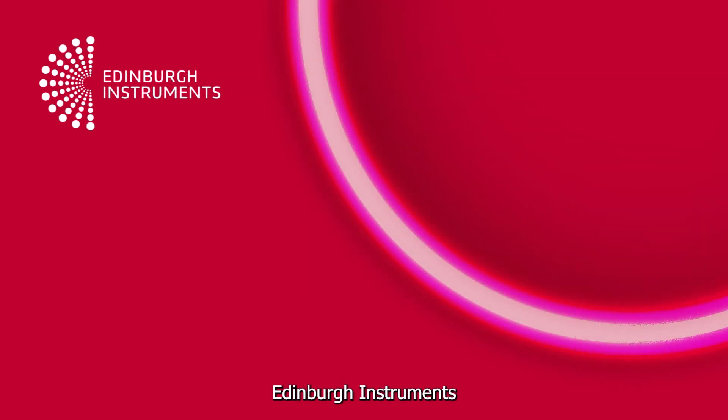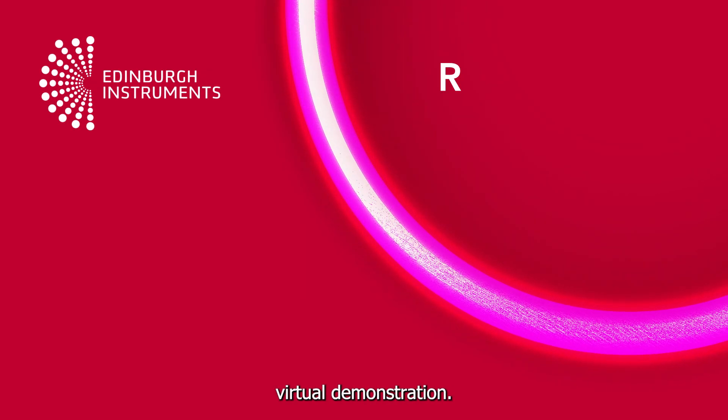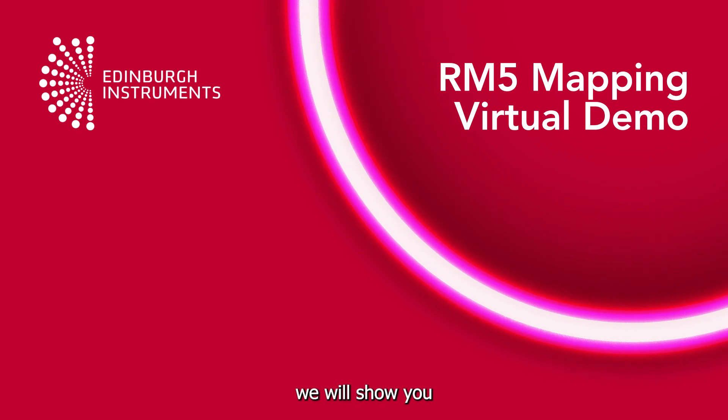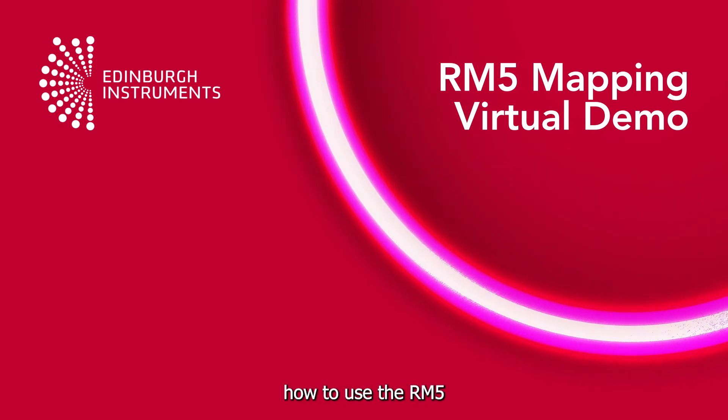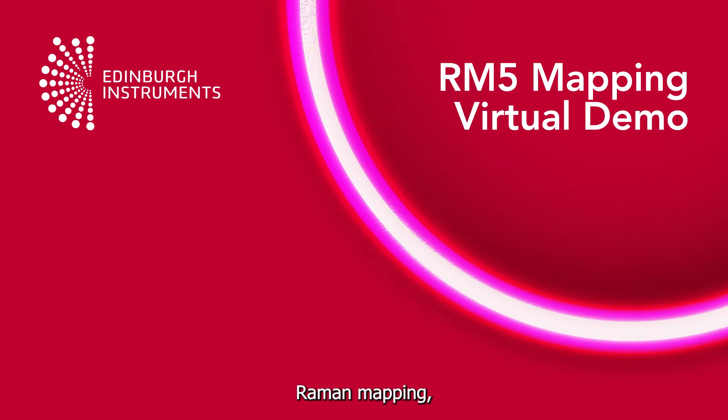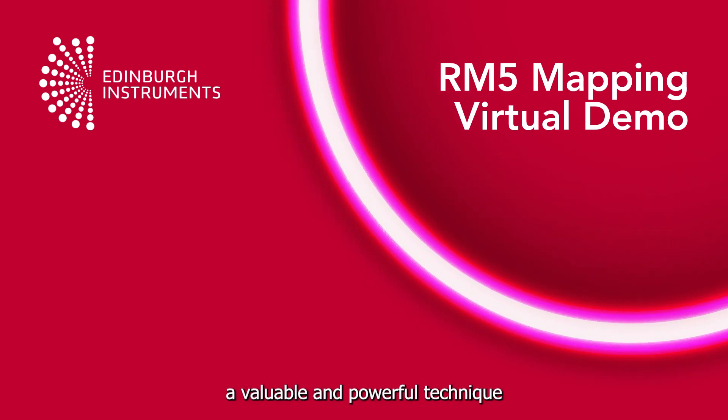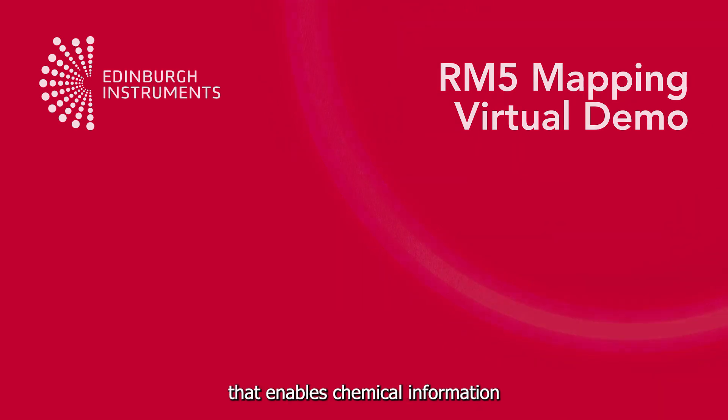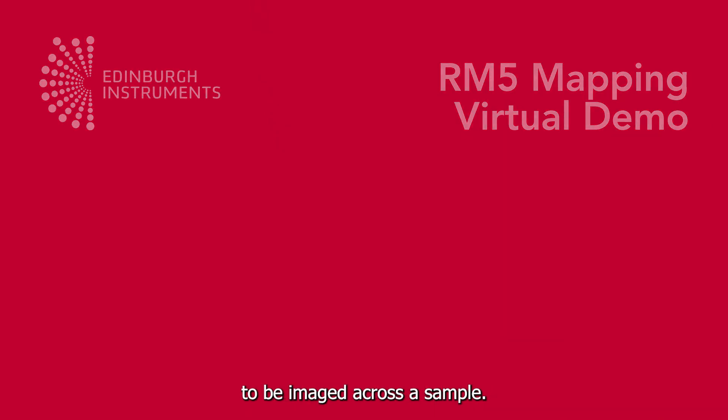Welcome to this Edinburgh Instruments virtual demonstration. Today we will show you how to use the RM5 microscope to perform Raman mapping, a valuable and powerful technique that enables chemical information to be imaged across a sample.